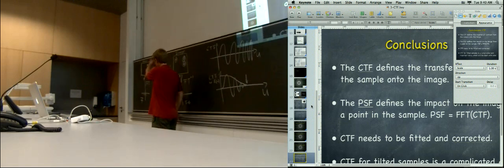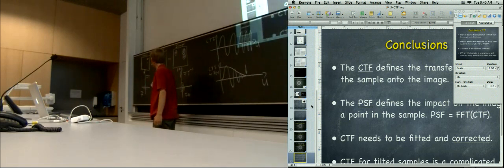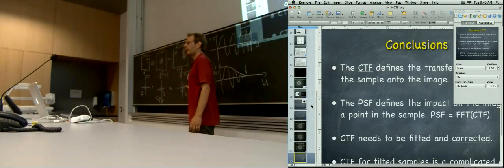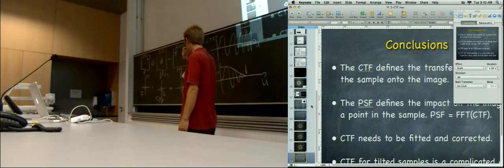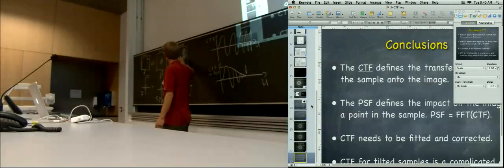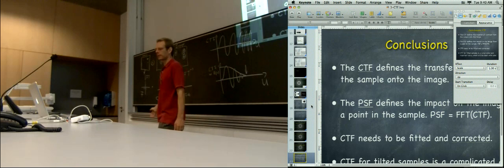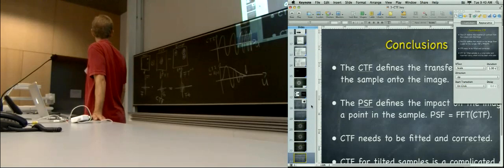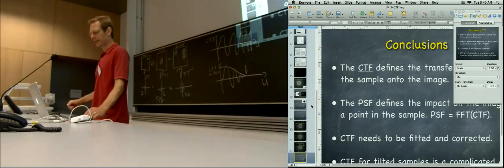So this thing, convolution in real space, is multiplication in Fourier space. We will need that all over, every single day, for everything. To understand the image formation, to do the image processing, cross correlation. This will come all over the place the whole week. So this is something we should just keep there.